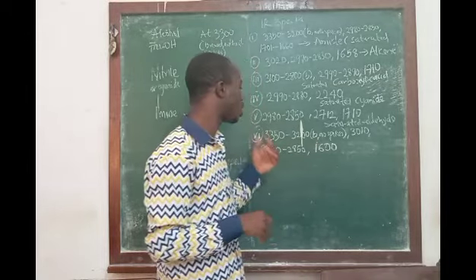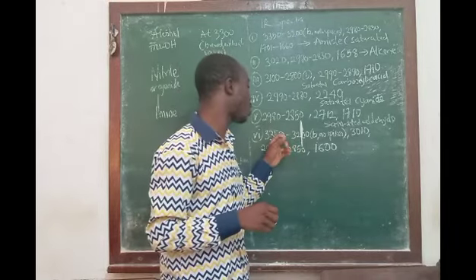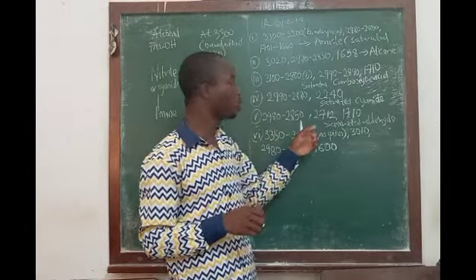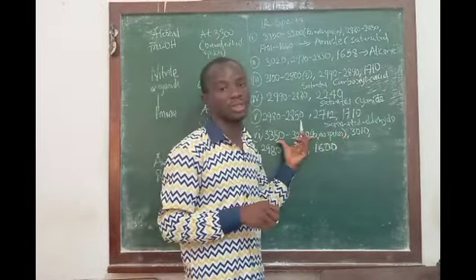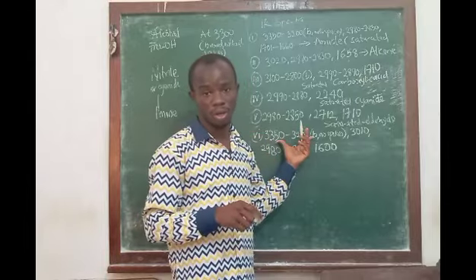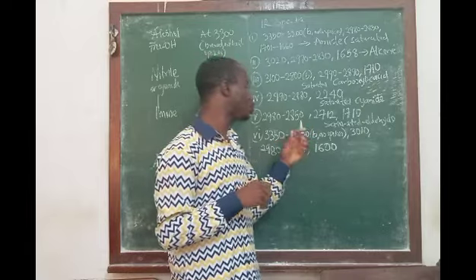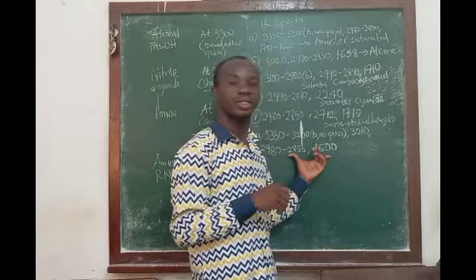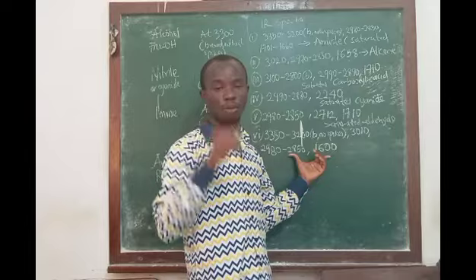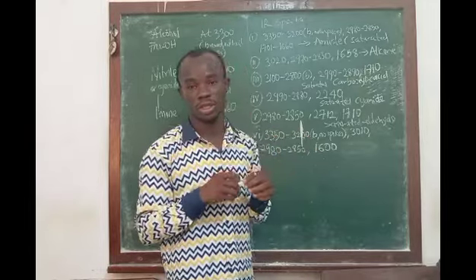At the same time, we also have a signal far above 3000, around 3300, between 3350 and 3200, which is broad with no spike. This signal is usually for an alcohol, a free alcohol not involved in hydrogen bonding. So the spectrum contains an aromatic ring and a free OH functional group.